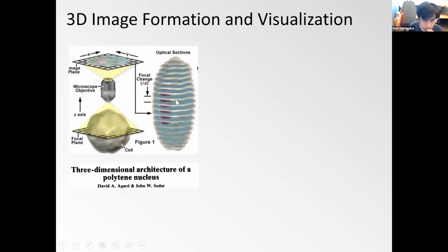So in traditional fluorescence microscopy, we acquire a 3D stack. So we're not like the computed tomography guys. We don't rotate the sample and acquire projections. We essentially acquire a focal series. This is just how we do optical microscopy. And here is the seminal paper by David Agard and John Sedat. If you just move the detection objective or the sample, you get these optical slices. We know in a wide field microscope, they don't come out as nicely sectioned, but this is the idea, and also the math underlying it is sound, if you want so.